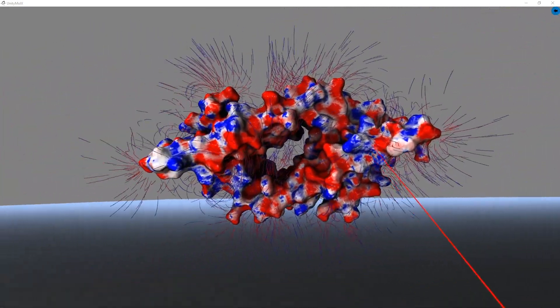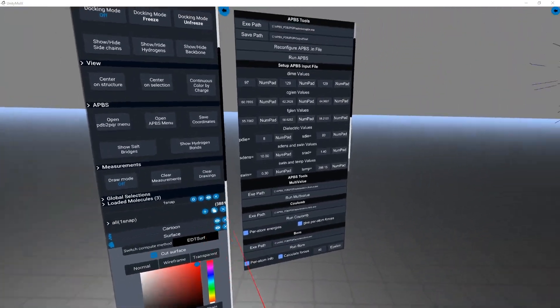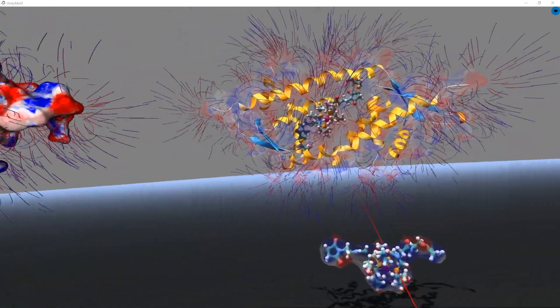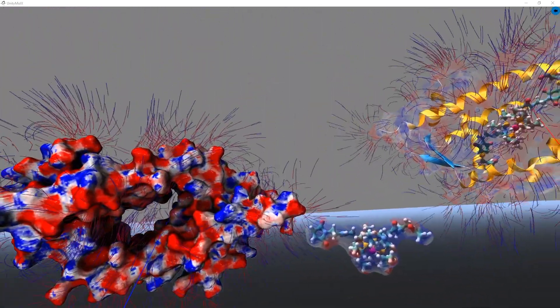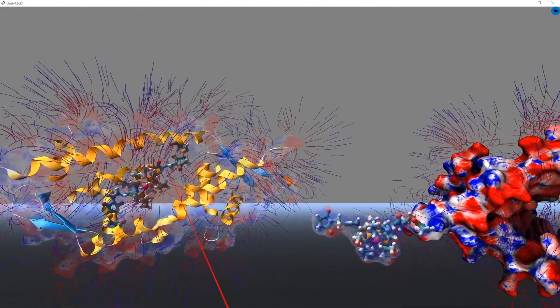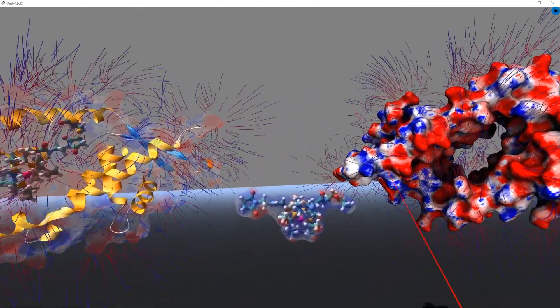Let's go back and set the enzyme surface back to transparent. As you can see, using a virtual world, it is very easy to manipulate multiple three-dimensional objects.